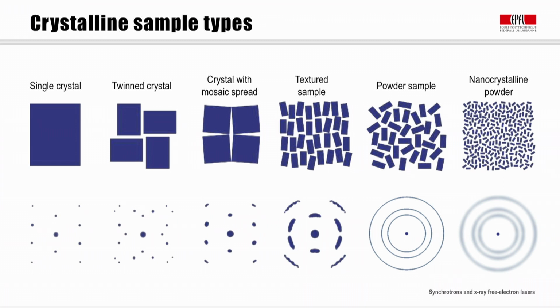A well-known phenomenon in single crystals is that of twinning, in which two crystals share crystal lattice points at a boundary in a symmetric manner. The resulting diffraction pattern of the twins, there can be more than two twins depending on the crystallographic system, becomes more complicated. For example, each diffraction spot of an untwinned system may be split into two or more closely lying features. One can therefore consider twinning as the first step towards disorder and eventually towards powder samples.